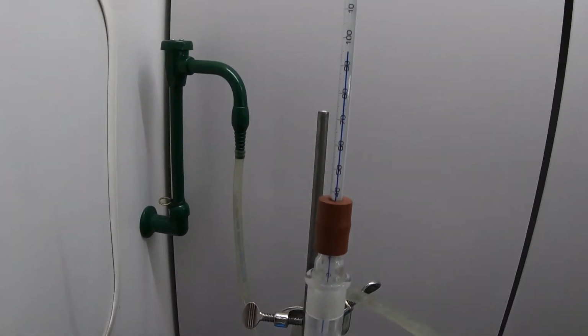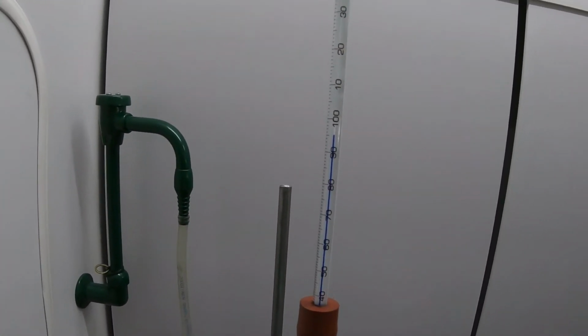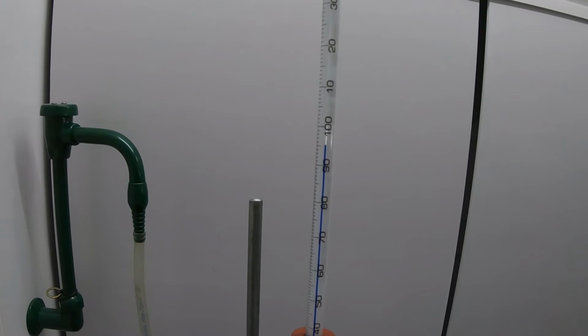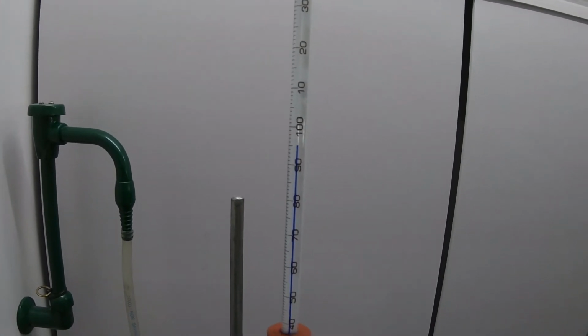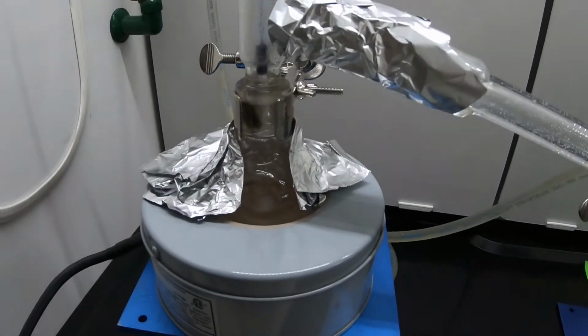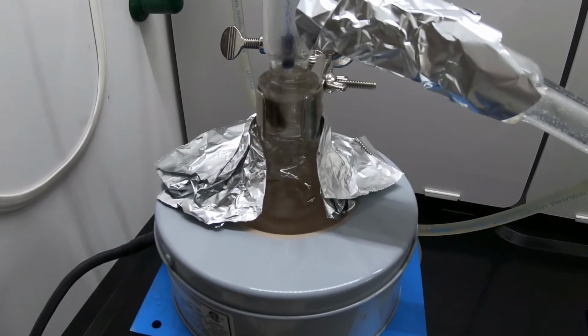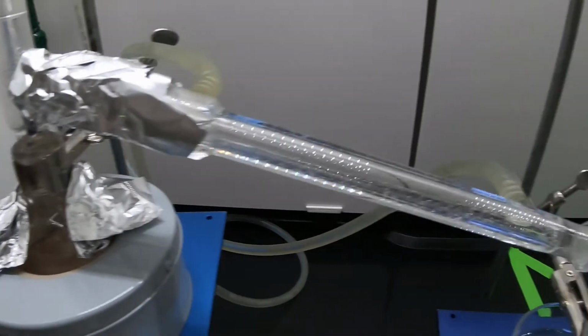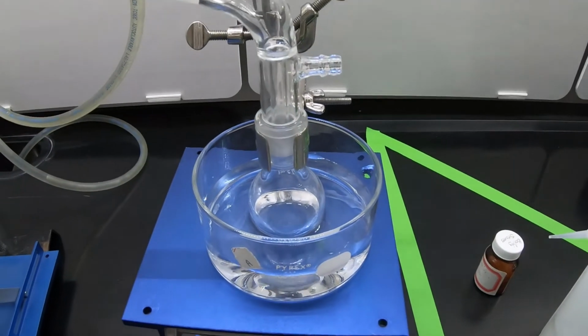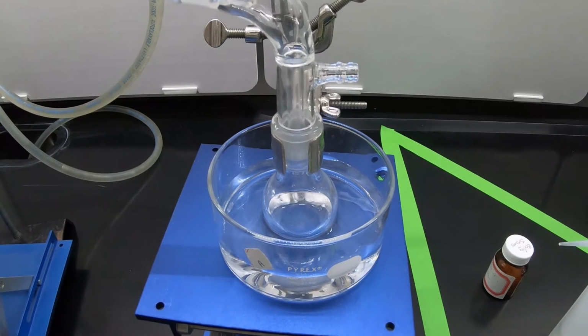The temperature at distillation is, as far as I can see, 95 and a half, 96 degrees Celsius. Discoloration, all right, we've got a light peach color happening here. Vigorous boiling and active collecting of material in the receiving flask.